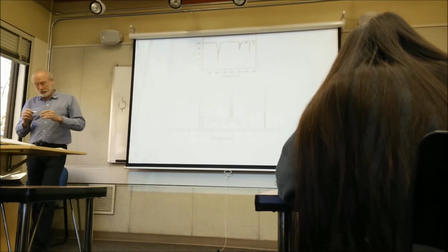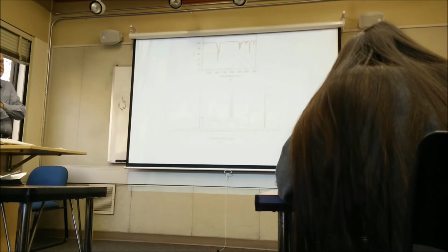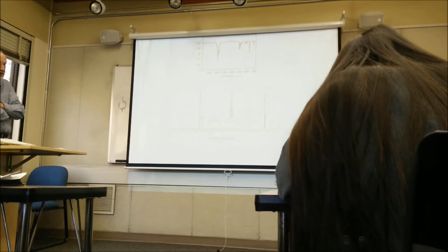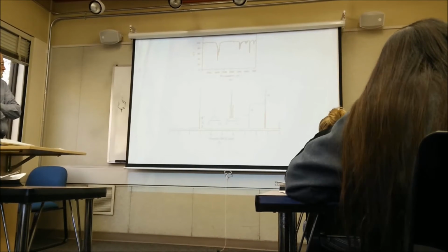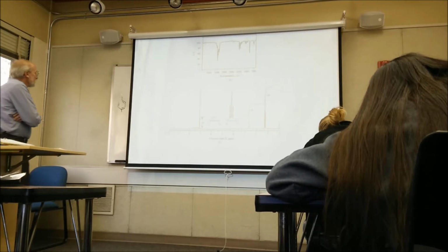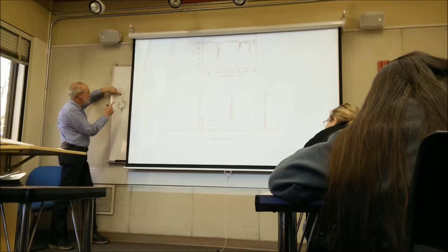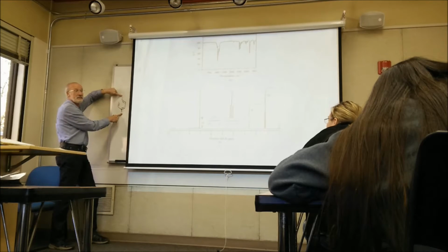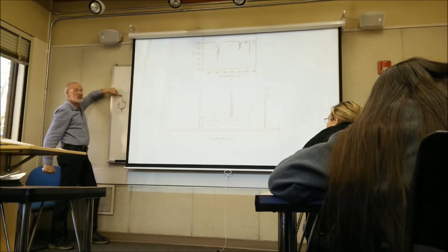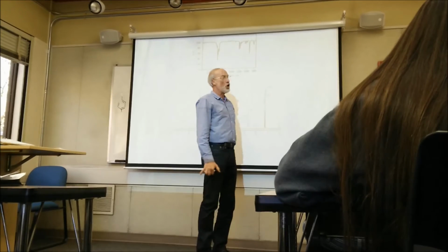And we've got 4 more carbons and 10 hydrogens. The possibilities are, there's only 2 of them, 2 carbons here and 2 carbons here, or 1 here and 3 there. No. If there were 1 here, no neighbors, that would be a singlet. We'd have a CH3 that integrates to 3 and is a singlet. Nope.